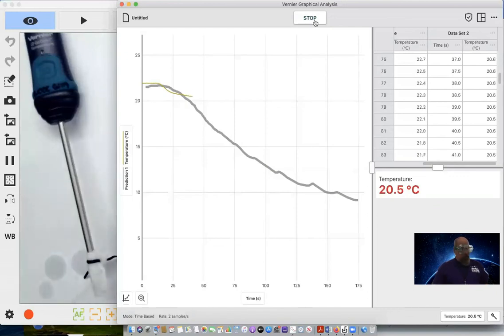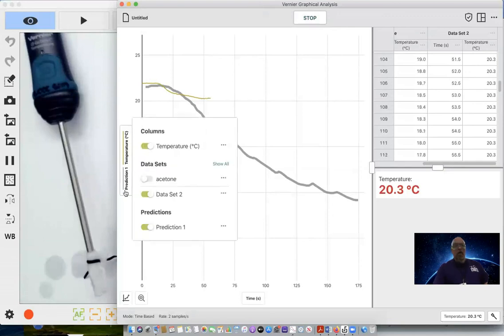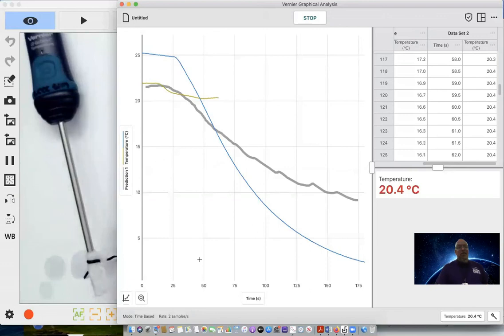But make sure that I've saturated the paper towel. So again, about 1 milliliter is what I'm using in each case. And I don't see where my first graph went. Well, on the y-axis, it's not gone. It's just not being highlighted. So I can click, and just as a comparison, I can see, oh, definitely, this is going at a much slower rate of evaporation than that of the acetone was.